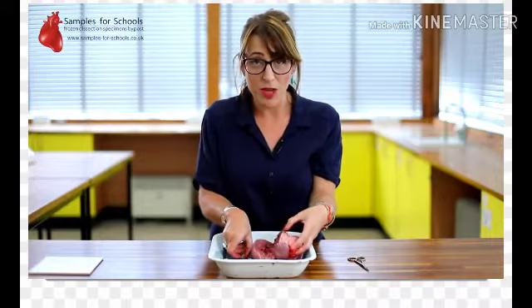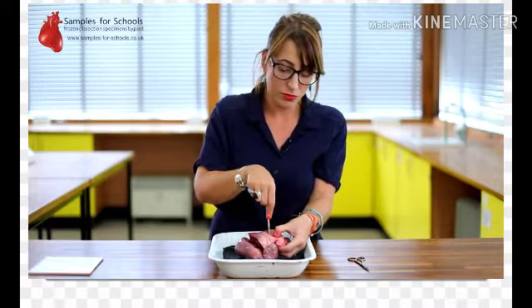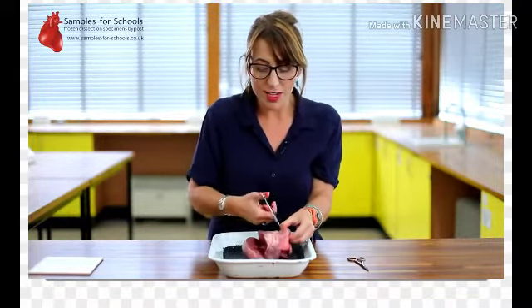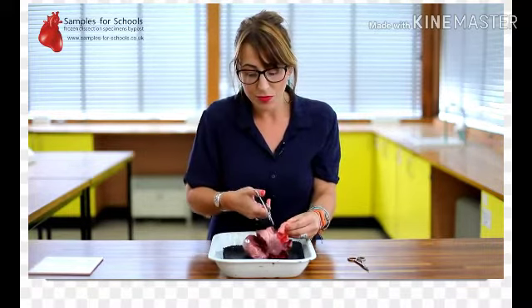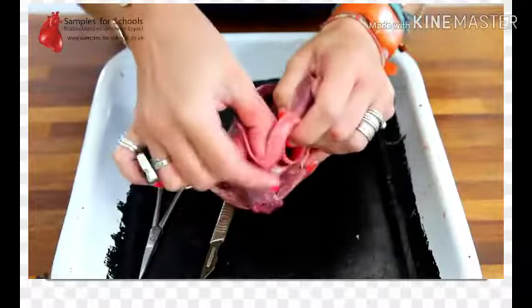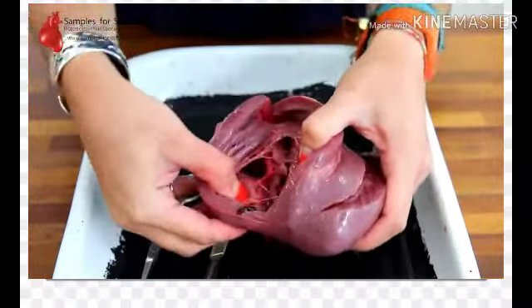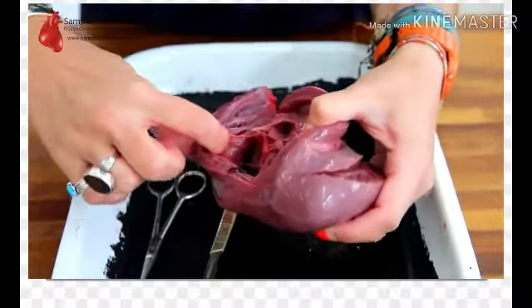The second incision we're going to make is going to be into the right ventricle. And again, take the scissors to cut up towards the atria. And in there we can see the right ventricle of the heart, much slimmer muscle wall, because the right side of the heart is only pumping blood to the lungs. So the blood is pumped under much lower pressure.